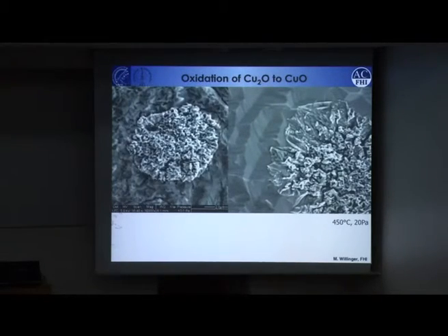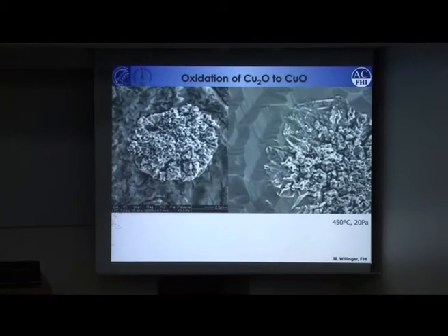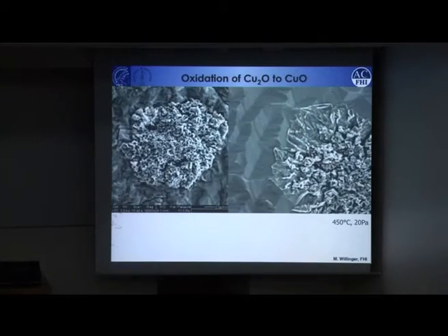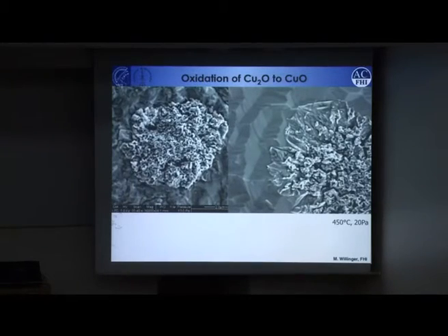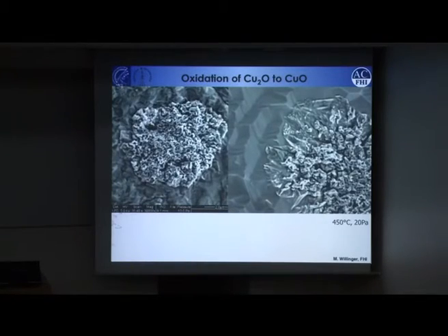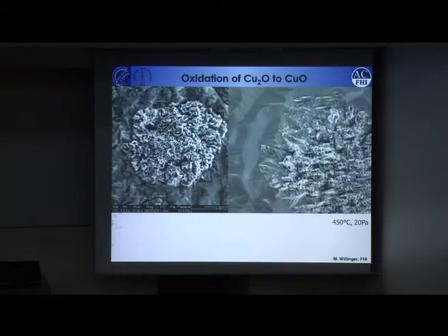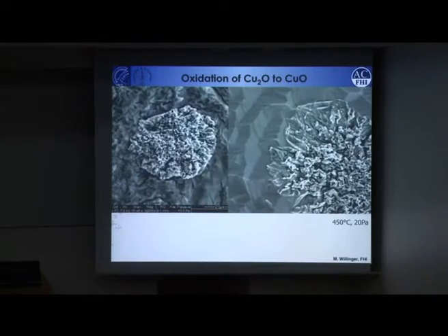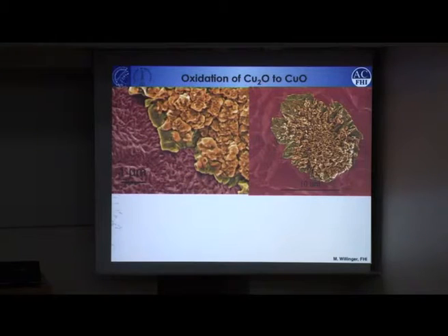The next step is once you have the copper oxide, so the first one that forms, the Cu2O, we can further oxidize to a higher oxidation state, to CuO. And you see that when the CuO forms, there is actually an interlayer first spreading out before you see the CuO. And that's very interesting for catalysis. So we do some catalytic reaction where copper is a catalyst, like ethylene oxidation, for example. And it's known that there are different copper oxidation states, but people so far do only spectroscopy. They see different oxidation states, but they didn't know how the surface actually looks during such conditions. Here it is colorized, and you can see better this interfacial layer that forms between the different oxidation states of the copper.